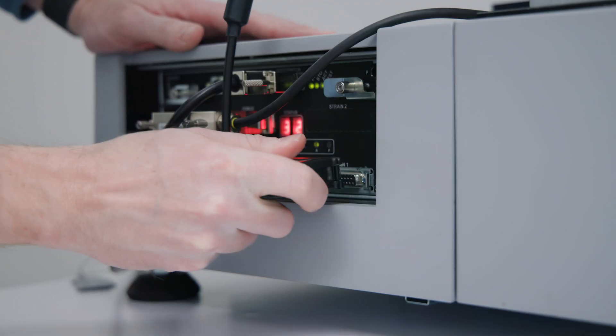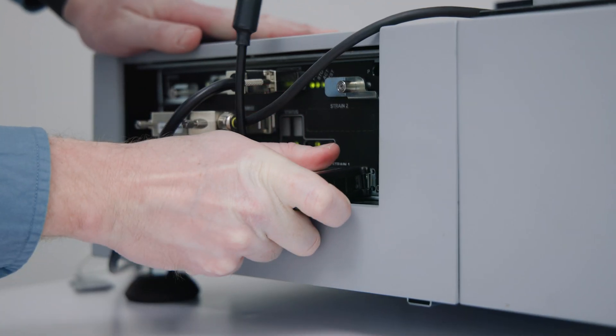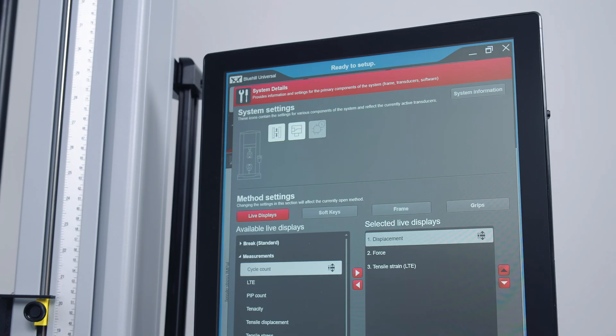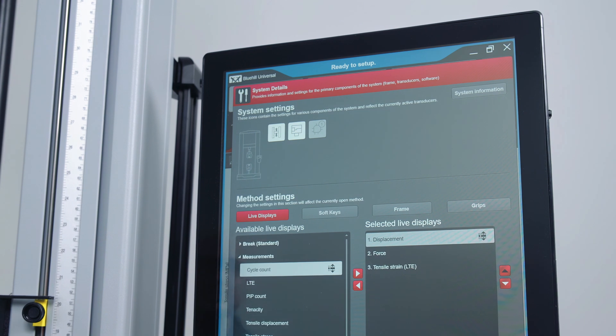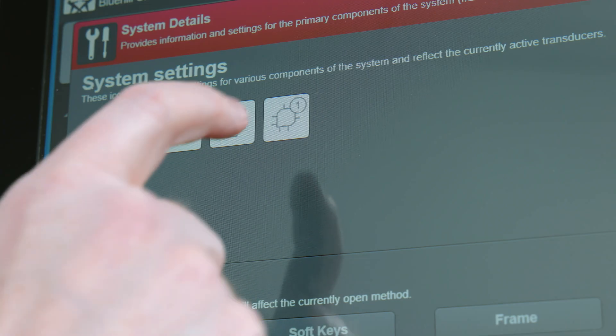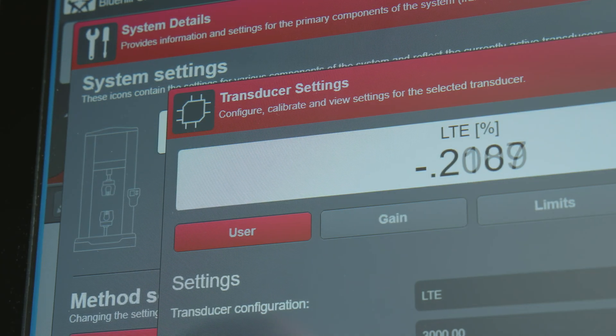The Long Travel Extensometer is self-recognized by Instron universal testing systems, making it easy to set up and calibrate when moving or installing onto a new frame.